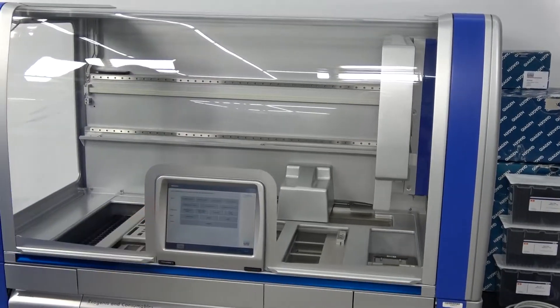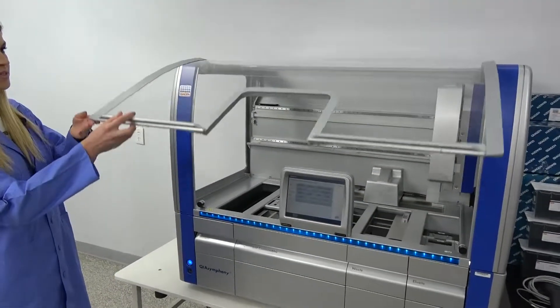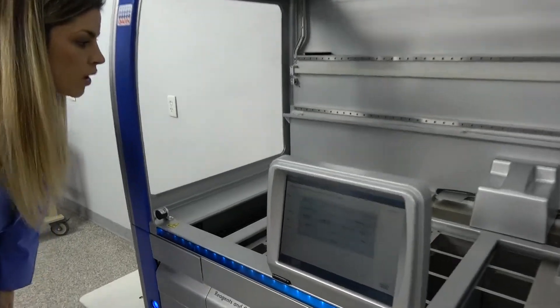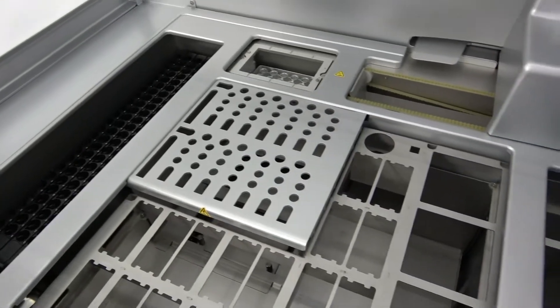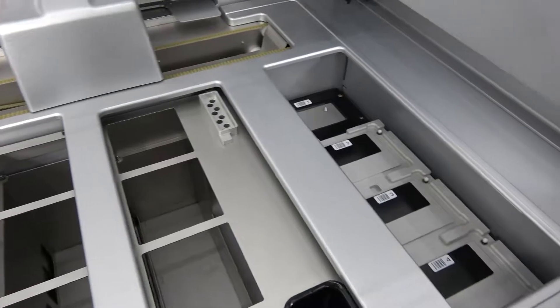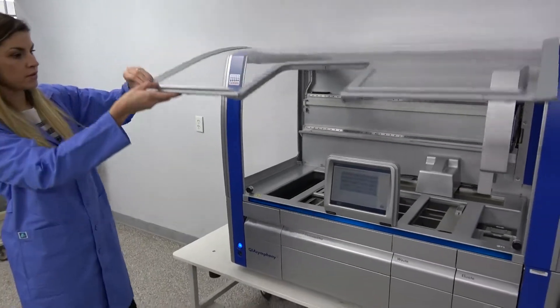It's really easy to use and it's very user friendly. We'll take a look at the inside here and you can see the areas in here have been really well maintained. There's no evidence of any spillage and everything is very, very clean internally. And we will put the hood back down.